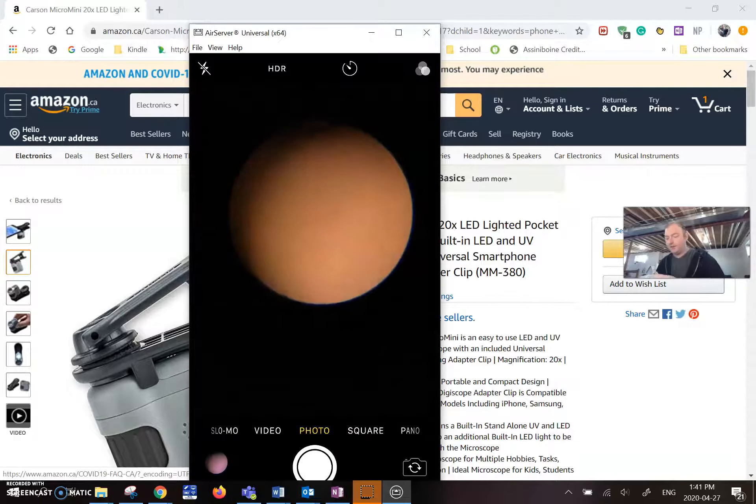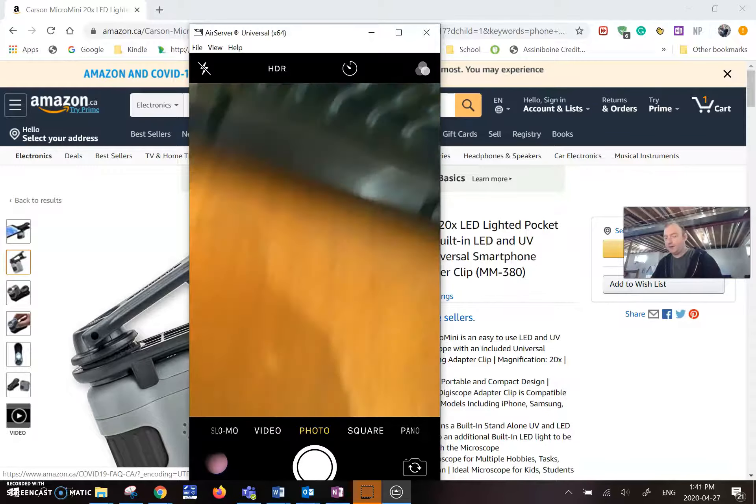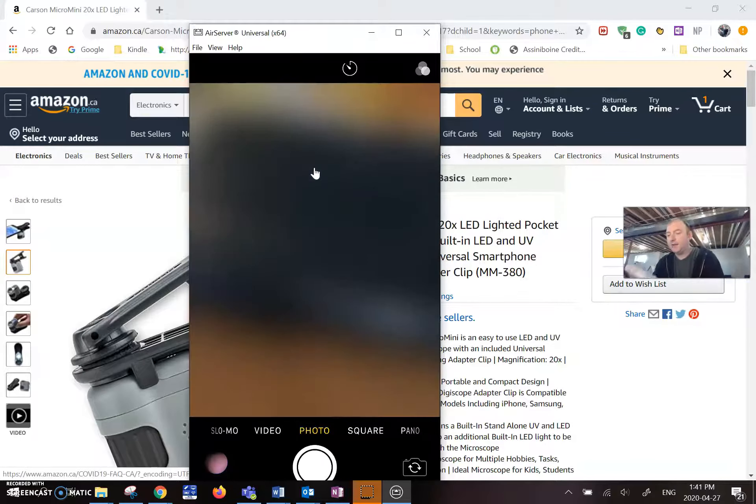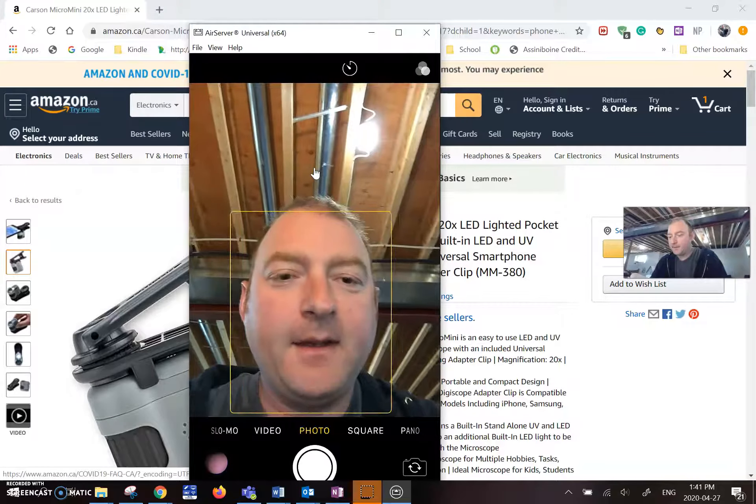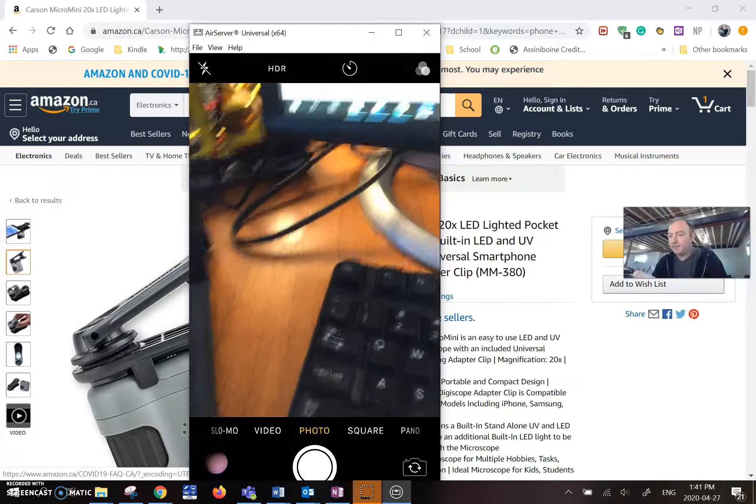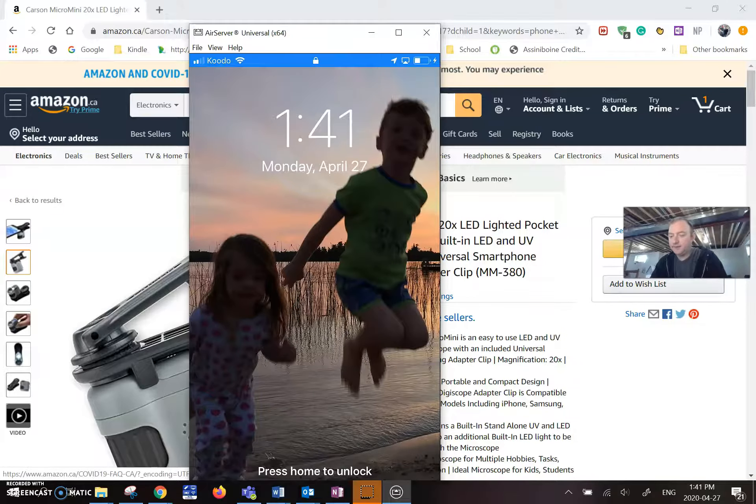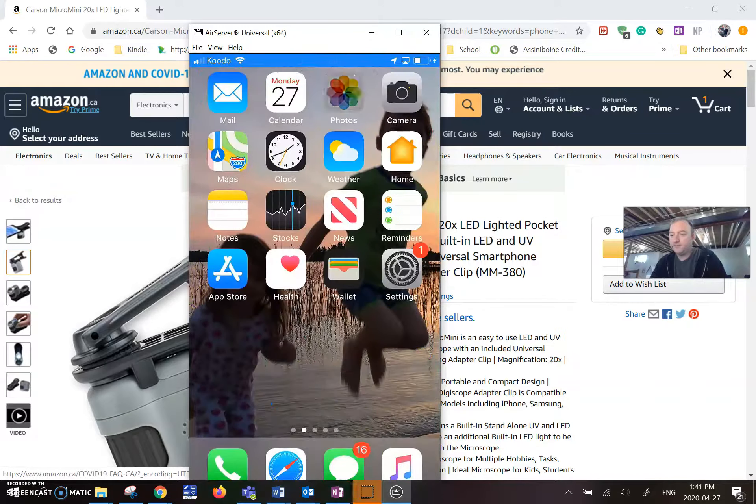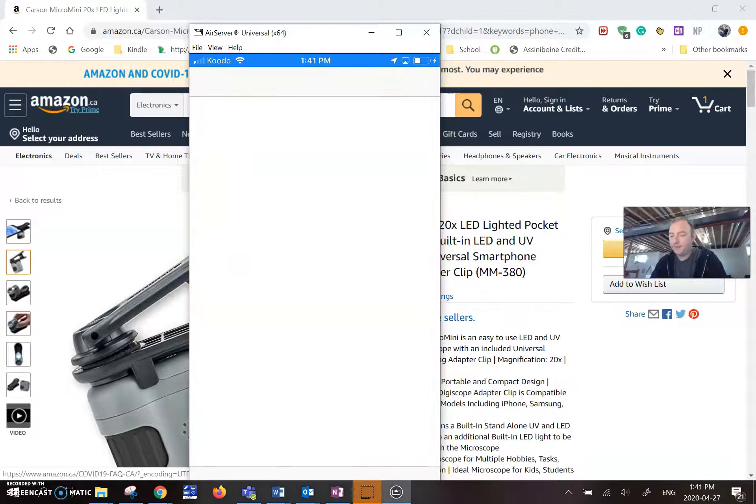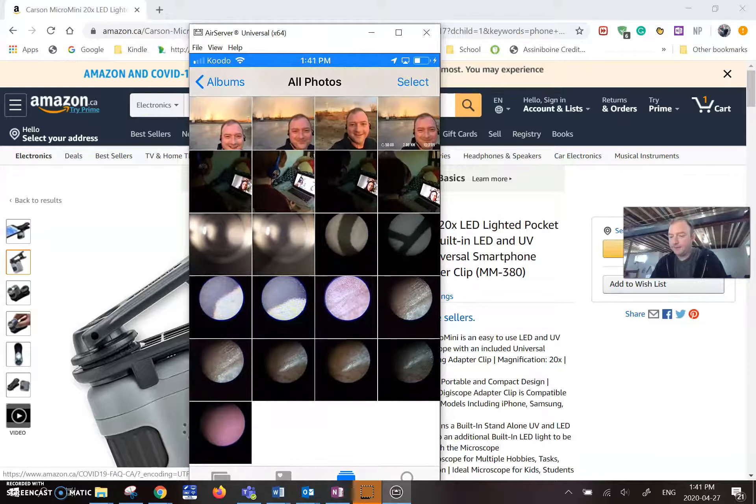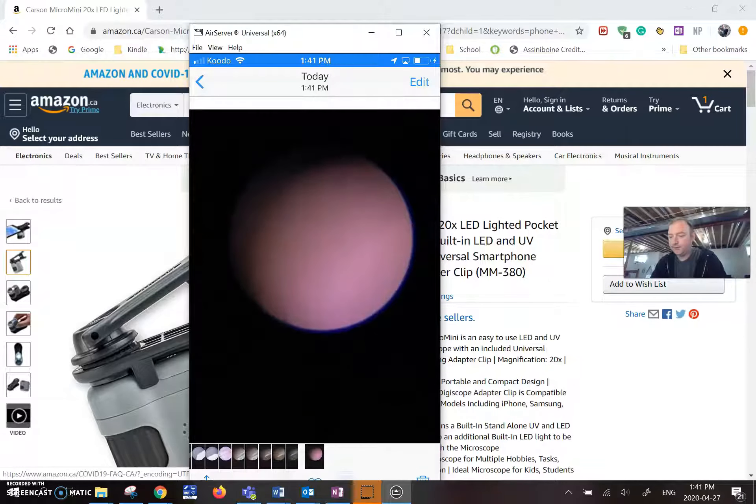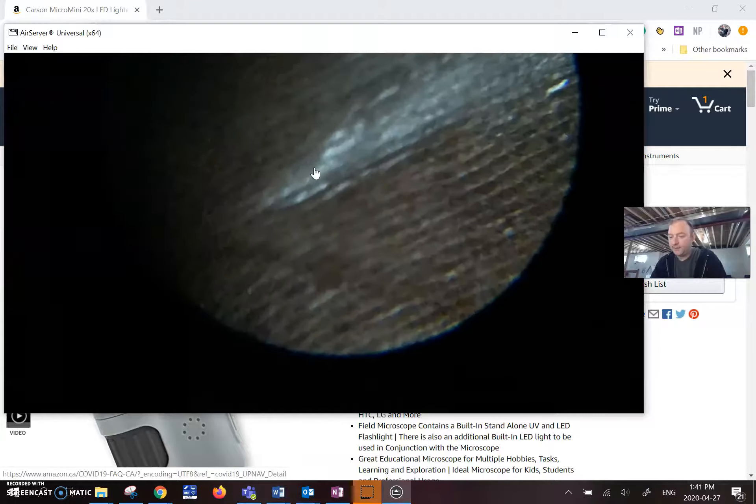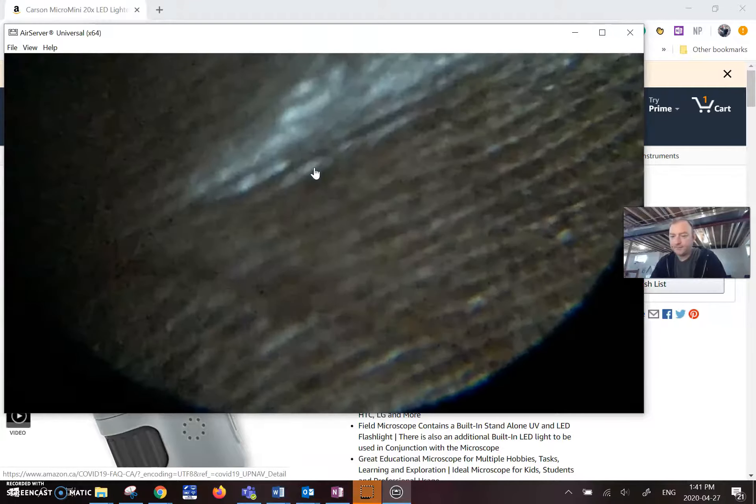So I can have a look at my photos now. I'll just take this off. You'll see that I'm right here. I'm going to turn that off. I'm going to look at my photo reel in my phone. And you'll see that I have my all photos. And you can zoom in on them.